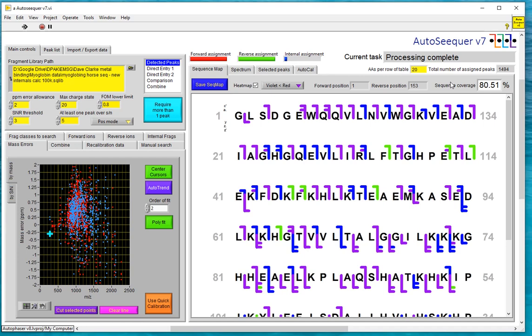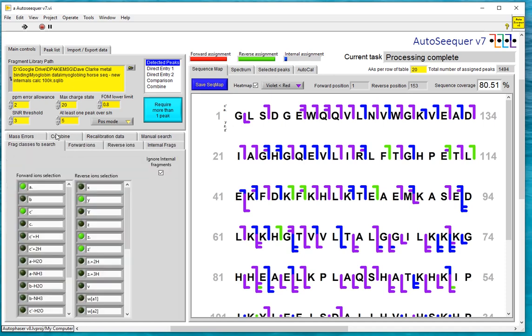And we've only been looking for the terminal fragments so far as well, so let's also look for the internal fragments. Obviously there are many more possible internal fragments than terminal ones, so I've sped this assignment process up because it takes about 5 minutes in practice. You can always follow the progress of the assignments using these progress bars up on top.